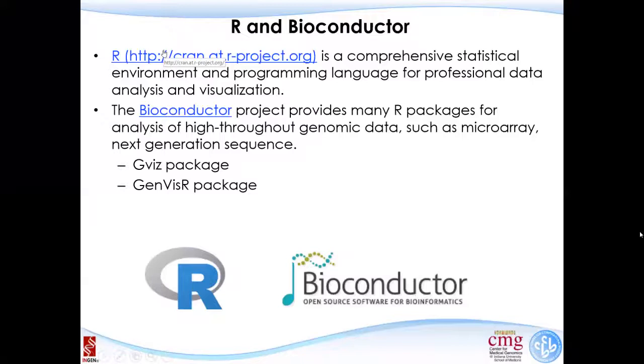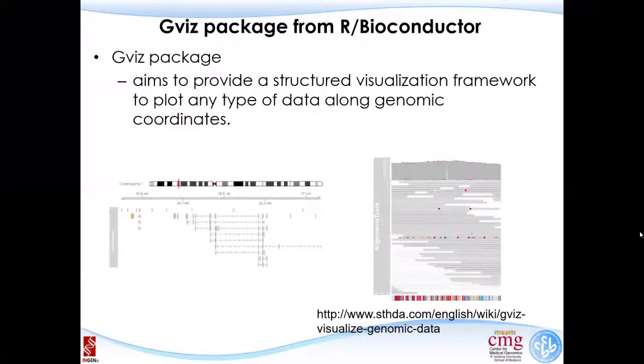Let me pick two over here, you can take a look. We can just see what it can do. So this is a figure from one of the Gviz packages. It aims to provide a structured visualization framework to plot all those types of data like what we see in the Genome Browser. Sometimes we can export the data from the Genome Browser, but if we have a flexible option, we can do more modification to the figures in R.